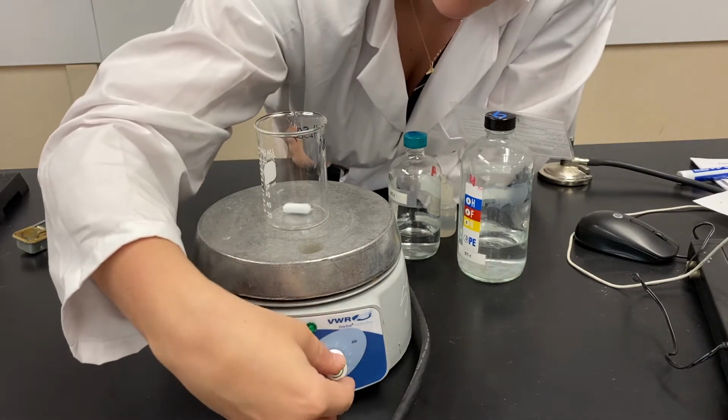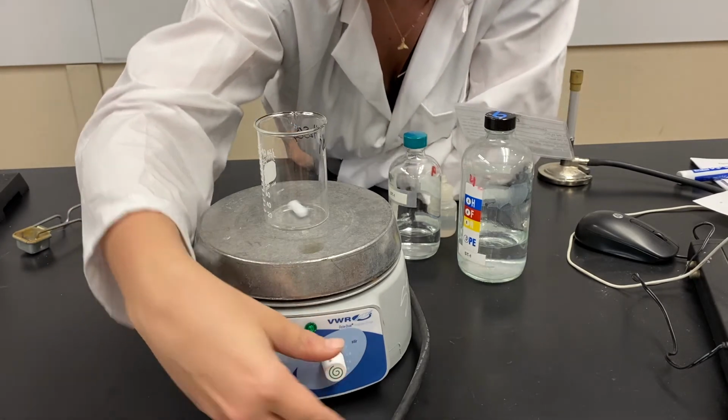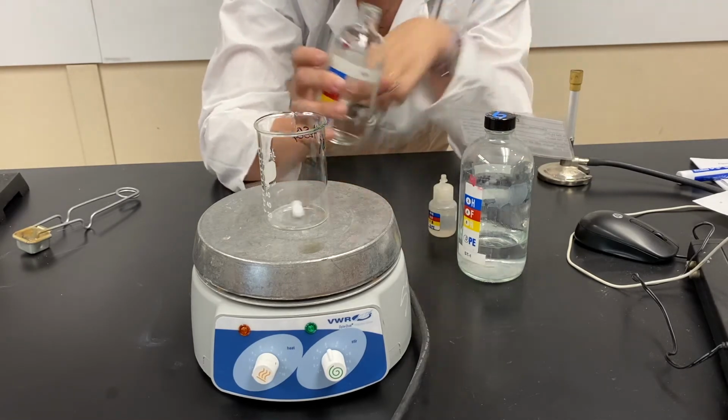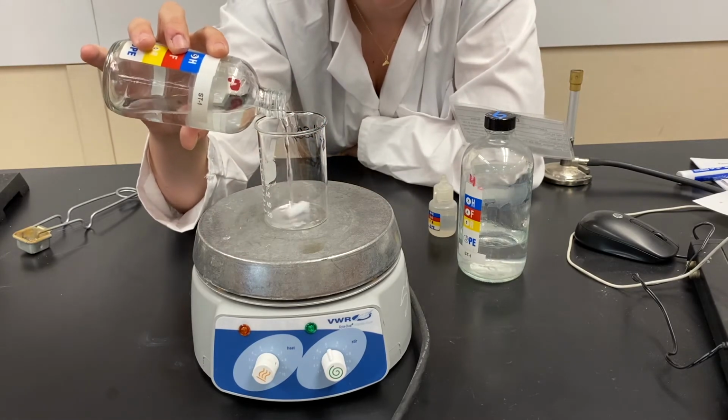Don't need it on ridiculously fast right now. Okay. There we go. So we are going to start with sulfuric acid, okay? So we're gonna add some acid here.